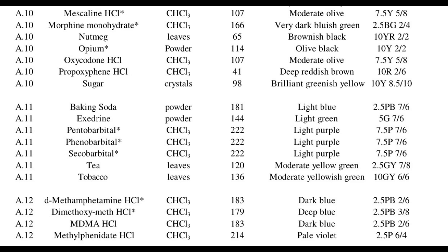The procedure is to add 1 volume of solution A followed by 1 volume of solution B. The color of a positive result is pretty much the same as it is for DK reagent from what I could find. The Munsell coordinates are very similar, as you can see. Although, do those really look like the real life test result? I guess, kind of. Yeah, okay, who am I kidding? No, they really don't. But nevertheless, that is what this document gives us.